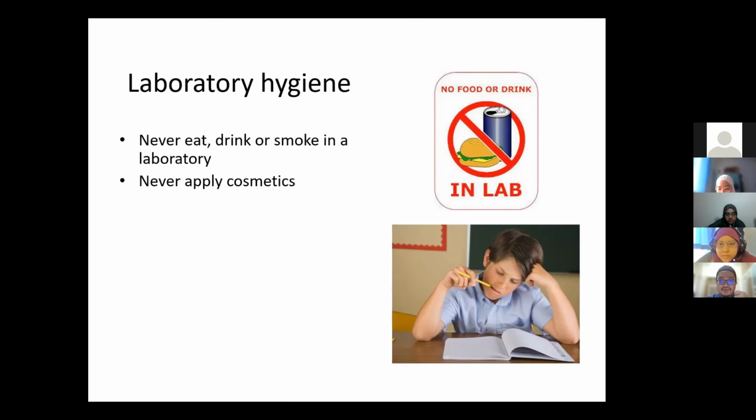Itu. Never apply cosmetics in the lab. Okay, never apply cosmetics.